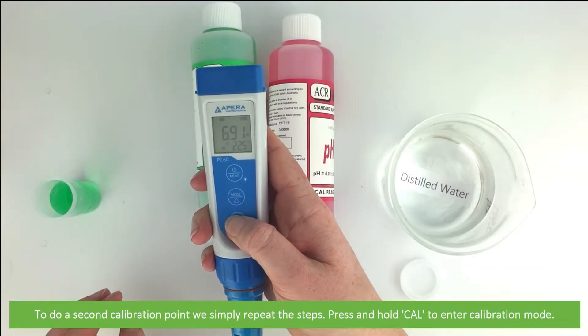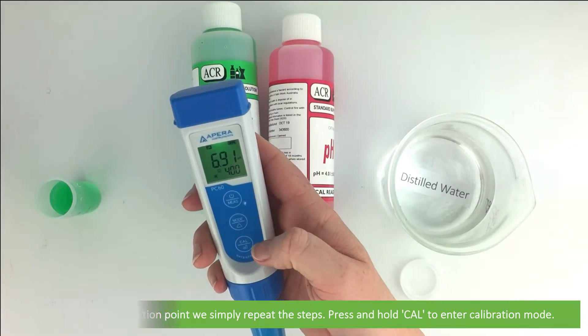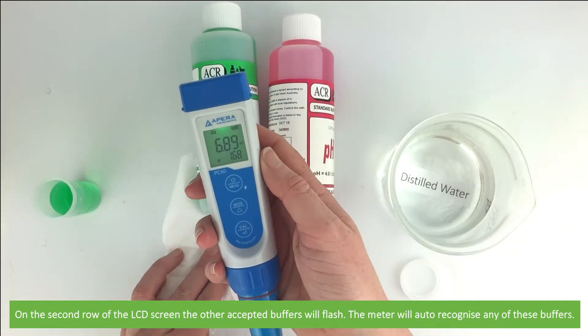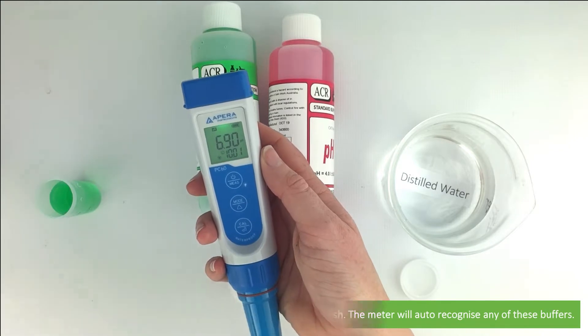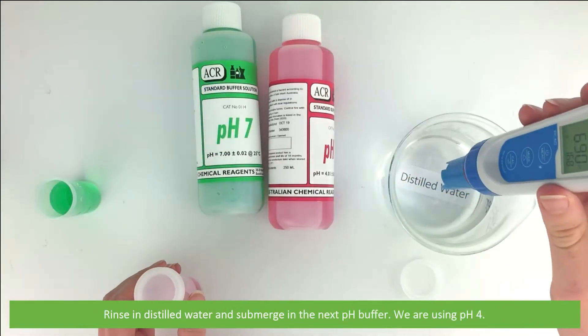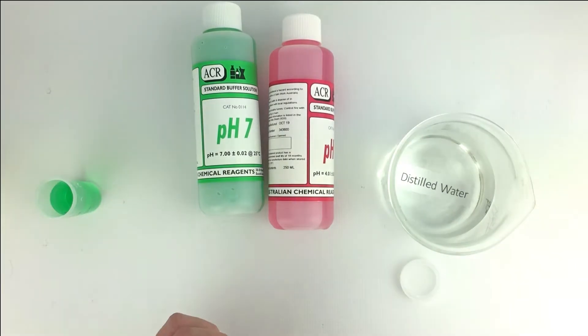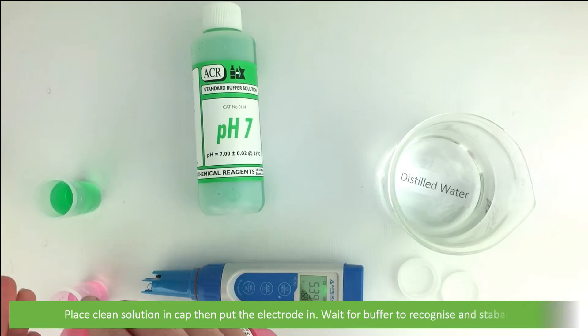To do a second point calibration we simply need to repeat the steps. Press and hold cal to enter calibration mode. On the second row of the LCD screen the other accepted buffers will flash, and the meter will auto-recognize any of these buffers. Rinse in distilled water and submerge in the next pH buffer — here we're using pH 4. Place fresh solution into the cap then put the electrode in.